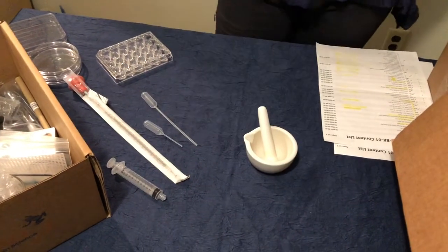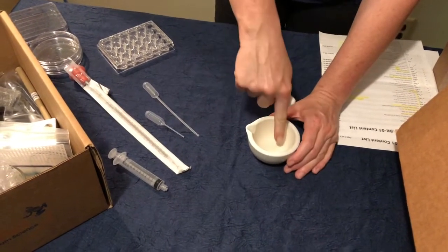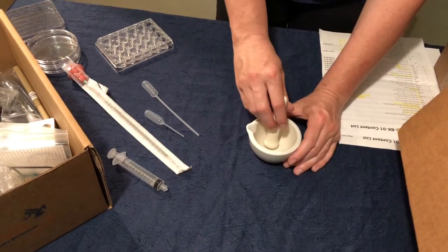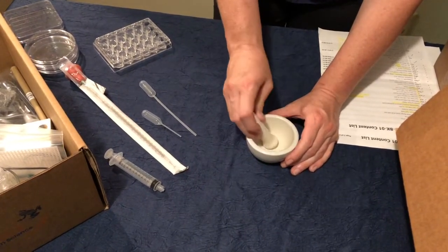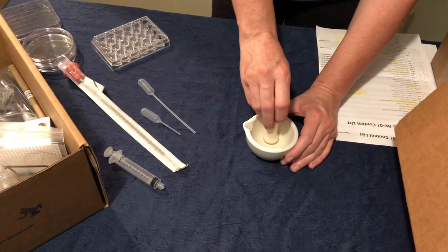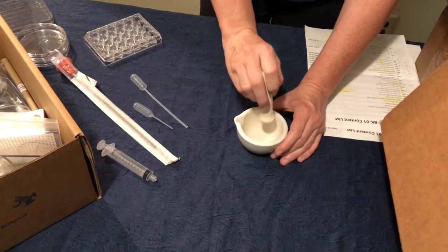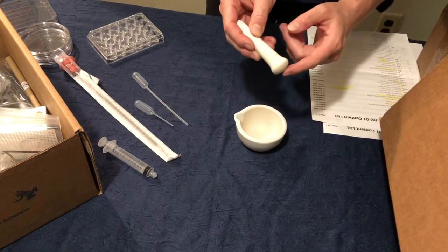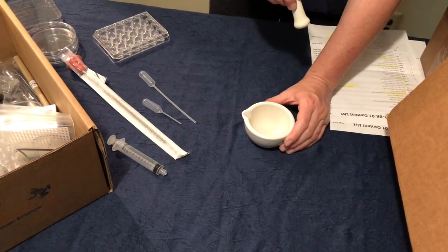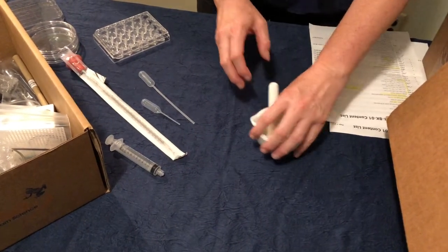This is your mortar and pestle, which will be used for grinding things. When you have a substance in the bottom of the mortar, you take the pestle and rotate it, rubbing it around — that is how we grind. Do not ever pound. When you pound, you risk chipping the tool and those chips will contaminate your substance. Make sure to use that round grinding motion.